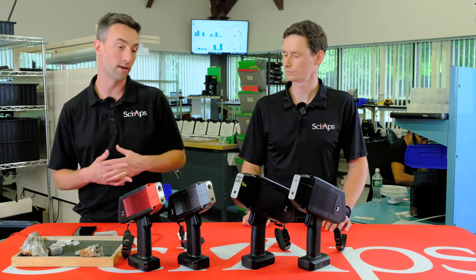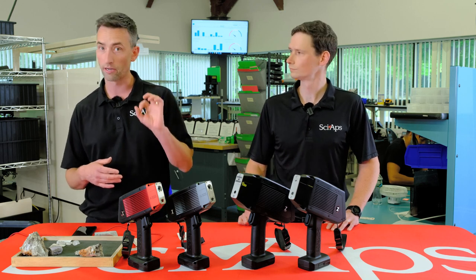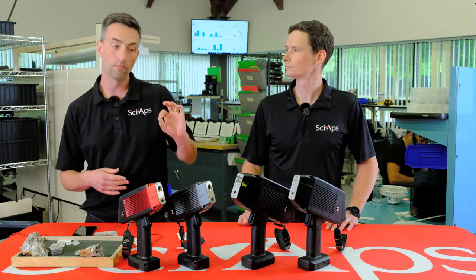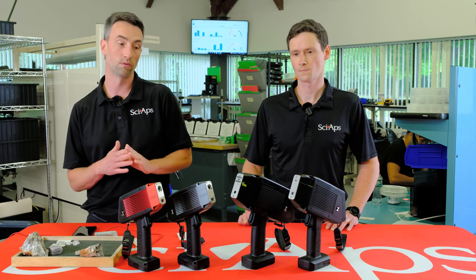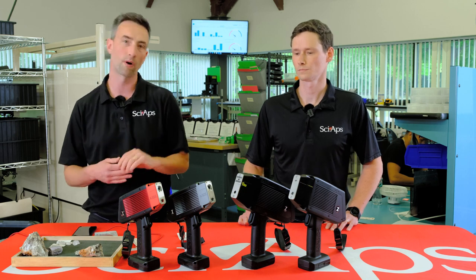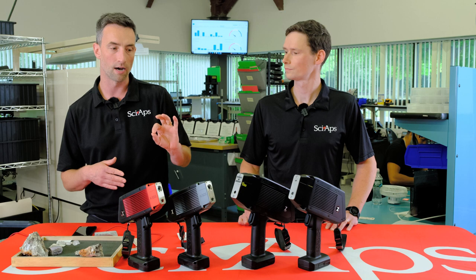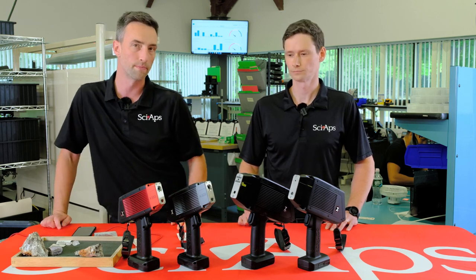One of the things that LIBS does really well is, you can be sure that you're targeting a specific mineral, and it'll give you, really quickly, within about a second or two, some good clues as to what that mineral might be. So it's not going to fingerprint and tell you this is feldspar or this is spodumene, for example, but it'll give you some really good clues as to what that mineral might be.